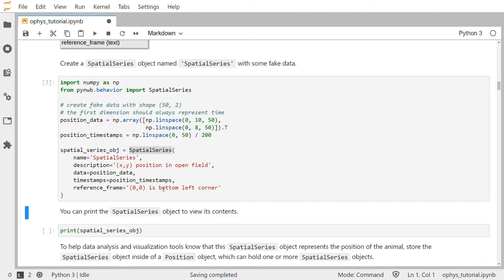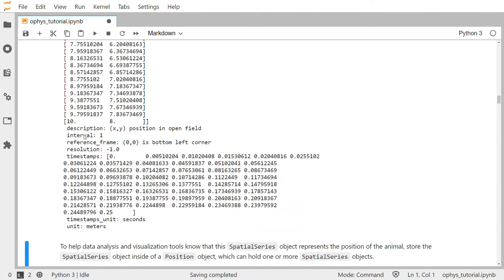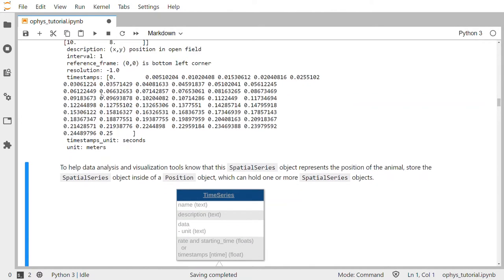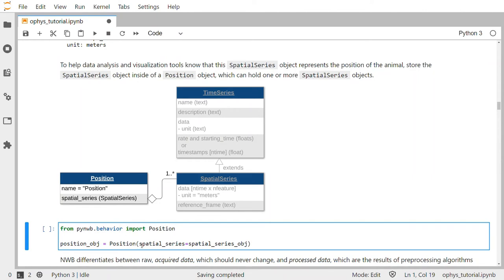You can print this spatial series object to view its contents, and you can see all the data we put in, as well as additional fields with default settings which you can change in the constructor. To help data analysis and visualization tools note that this spatial series object represents the position of the animal, let's store the spatial series object inside of a position object, which is a simple object that can contain one or more spatial series objects. We can import the position class from PyNWB.behavior and call the position constructor, passing the spatial series object. If we have more than one, we can pass a list of spatial series objects.